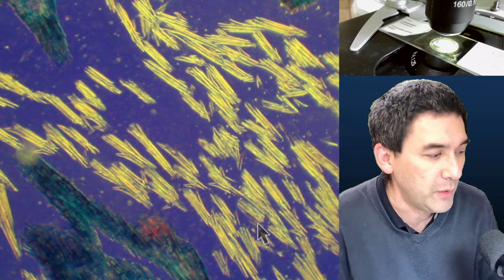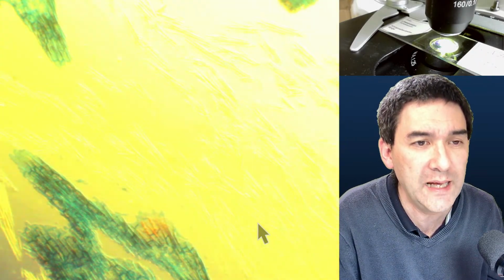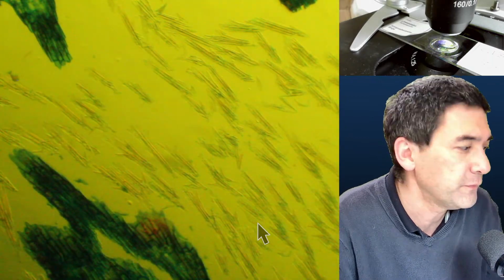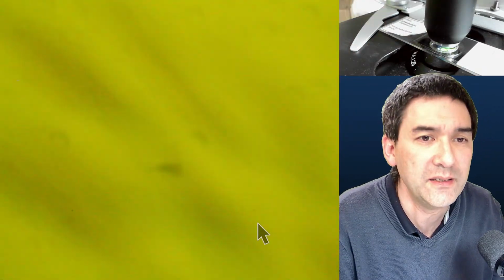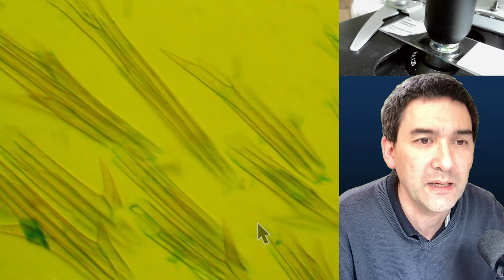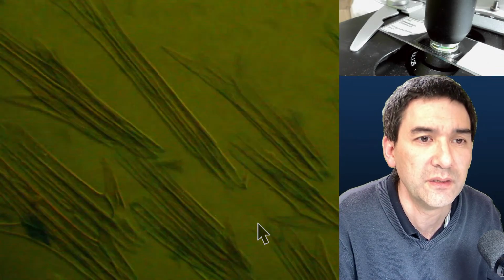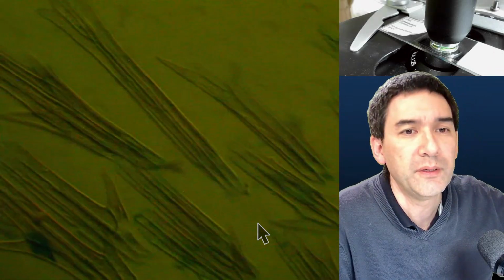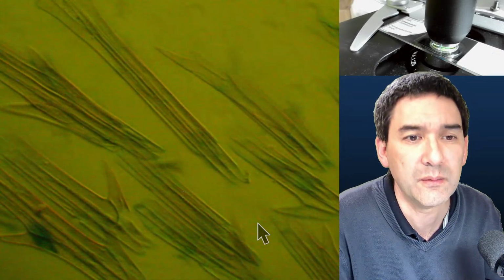However, I just want to show this to you here as well. If you use a regular dark field filter, a Rheinberg filter, and you move it out from the center, so that you have light only coming from one side, like over here, that's better like this. Let me turn up the exposure time a little bit. I'm already at the maximum.